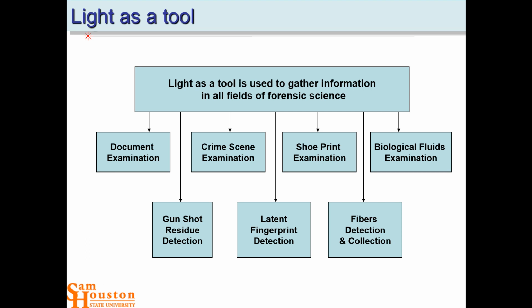Yeah, so luminol is an interesting compound. In the presence of iron, so it's looking for blood. If you have a luminol solution, this is a molecule that's been activated by hydrogen peroxide, and so it's in an excited state. If it comes into contact with a metal that will activate it, like iron, then it will chemiluminesce. So it's a chemical reaction with iron that emits light. It's very cool. You can spray this luminol on a spot that you suspect might have blood on it, and get your camera ready, which now with video, you would be videoing this. You would spray the luminol on there, and the chemiluminescent reaction would show where there's blood.